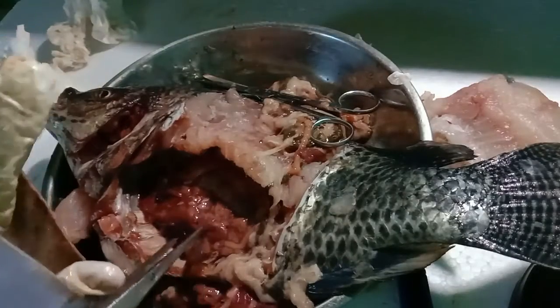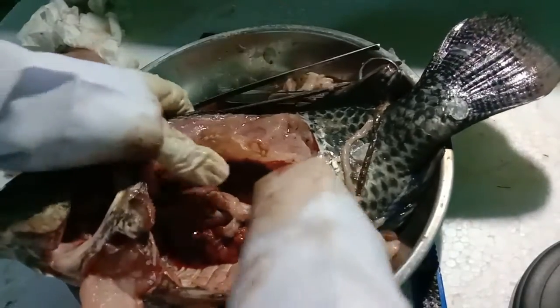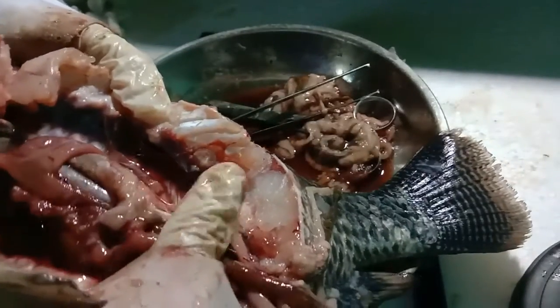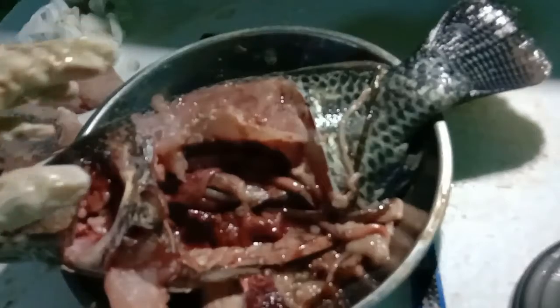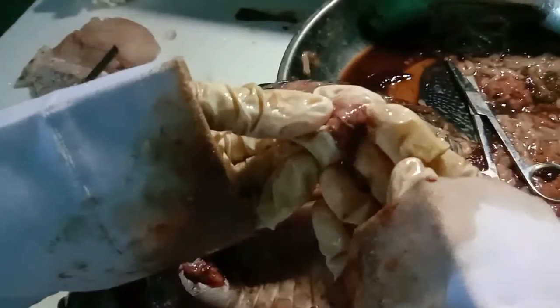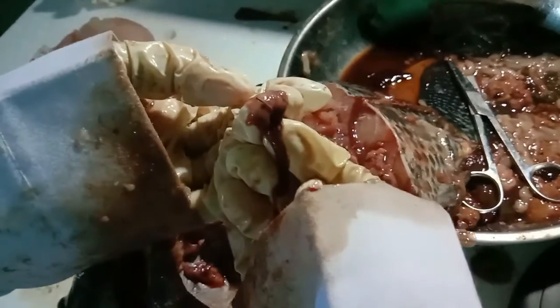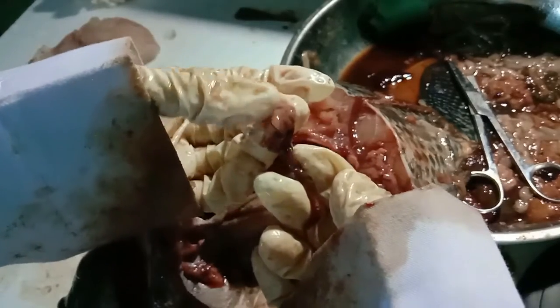Next is the vein and the artery. The artery is like a red thread. You can see it once again. It's there. This is the artery here. The color of the artery is red, while the veins are blue. So actually, there is a vein here, because there's a black thread there. That is the vein. The vein color is blue, so it looks much like black here, so that's the vein.